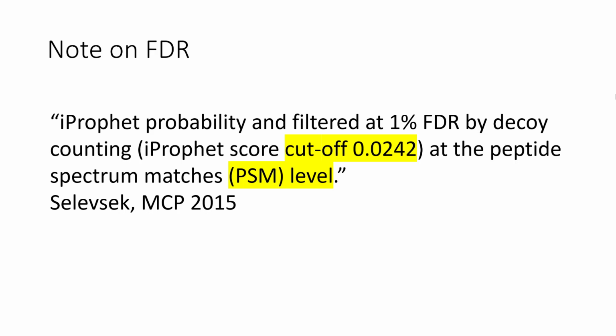And then this is the first paper I know of that said, well, we can also do all kinds of crazy fractionation and create a bigger library. Now we'll do single shot DIA. We don't expect to find everything in there. And if you had been a reviewer and said, well, that's really permissive, they probably would have just responded that those things will fall out in the false discoveries.